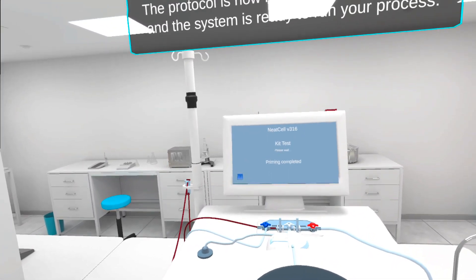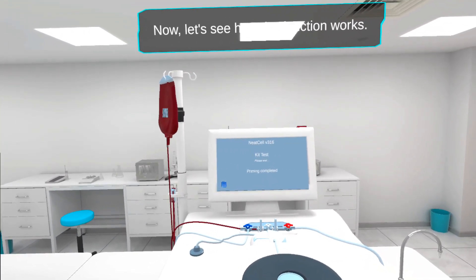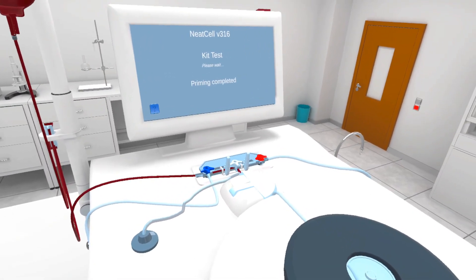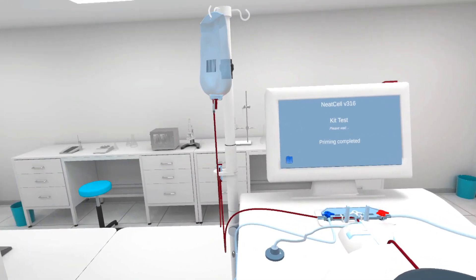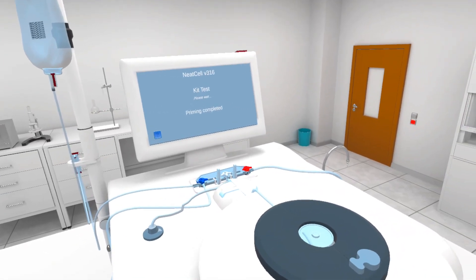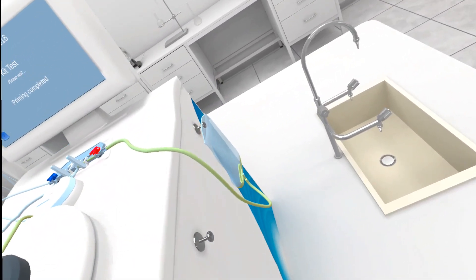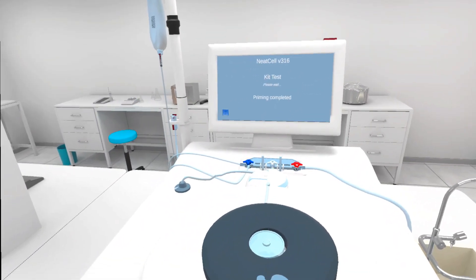Congratulations! The protocol is now loaded, the kit is installed, and the system is ready to run your process. Now, let's see how the function works. The sample first flows through the optical sensor into the separation chamber inside the chamber pit. The sample is processed inside the separation chamber. The plasma from the sample is extracted and flows into the FICOL bag.